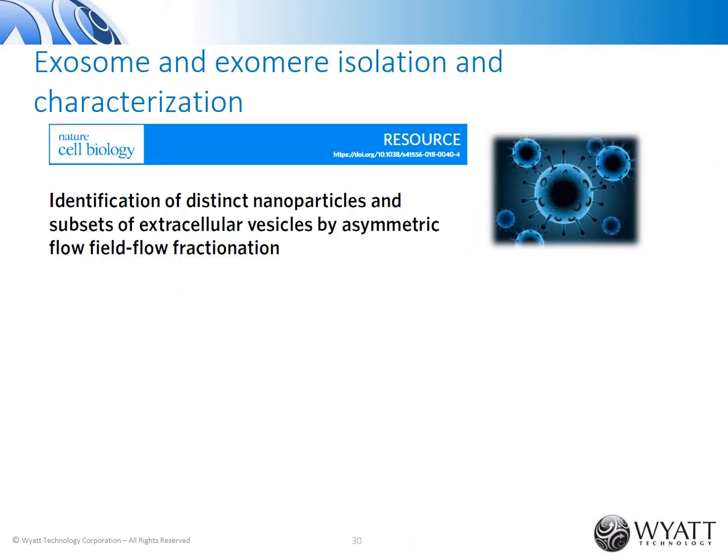I have one more example of the impact of FFF in biology and medical research. Recently, a paper published in Nature Cell Biology showed how AF4 allows to identify subpopulations in exosomes, which could not be separated before with other methods. This is significant because each of these subpopulations has a different biology function and carries a specific fingerprint of proteins and biomarkers.